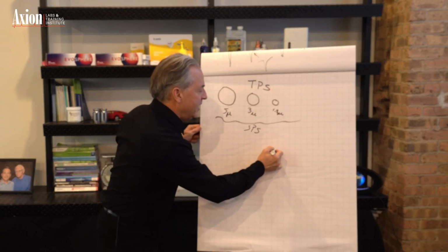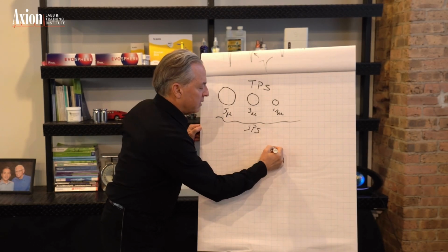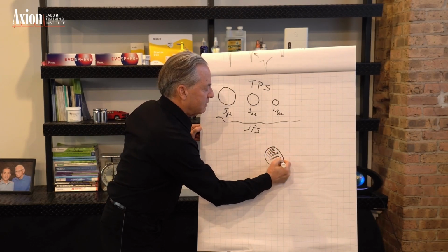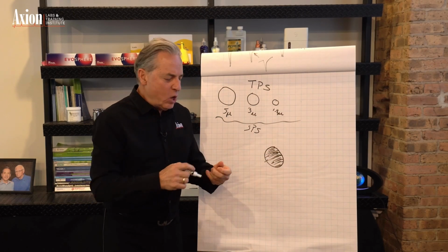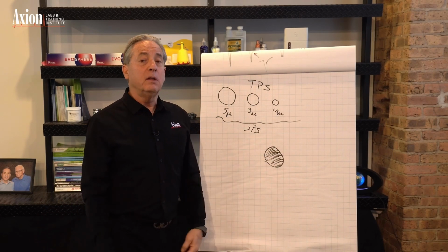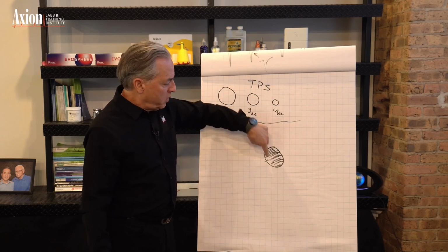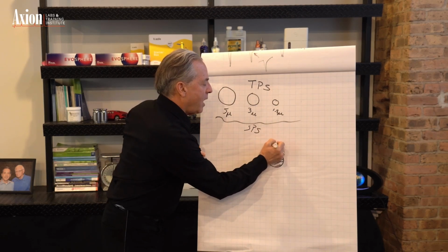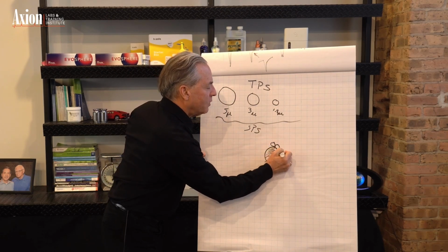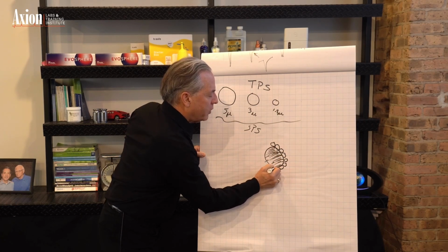So the idea is we're going to start with a solid material. So I don't know how to draw solid. This is solid. It's like a glass marble. There's no surface on the inside. It's hard. In the old days, we called this pellicular material, which means the inside is non-porous. There's no chemistry going on down there. But we're going to put on a bunch of tiny little particles, and these tiny particles are totally porous.